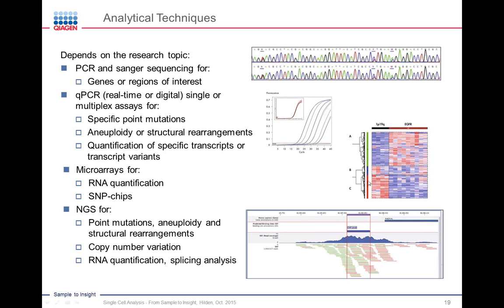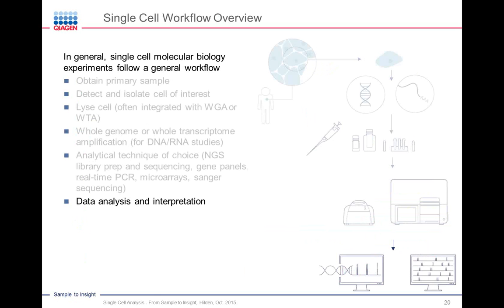If you're doing microarrays, that's also an option, and NGS as well. That's one I think a lot of us are using. And then data analysis and interpretation.